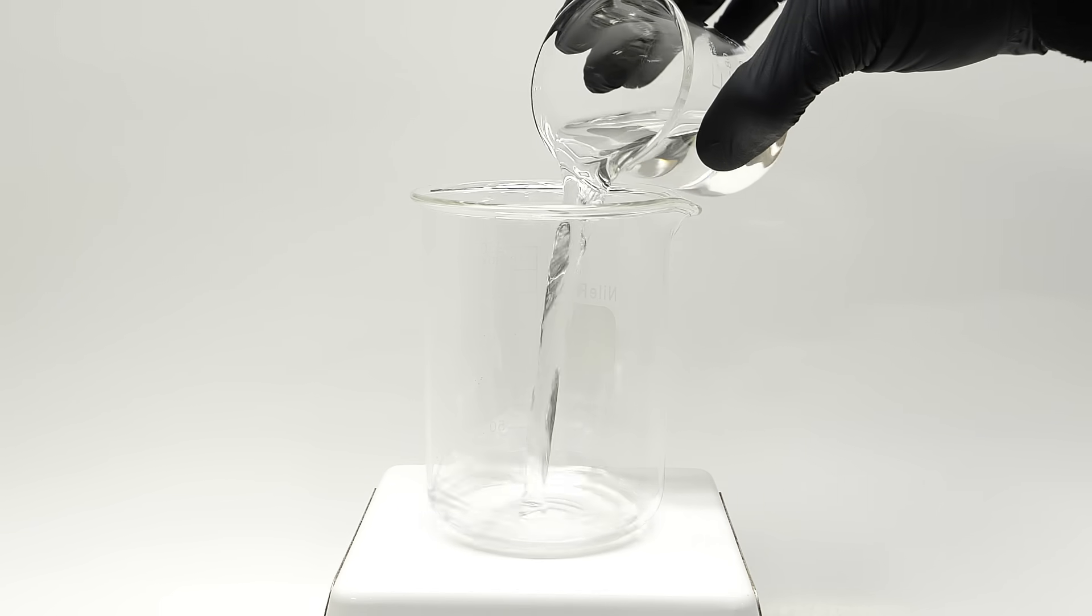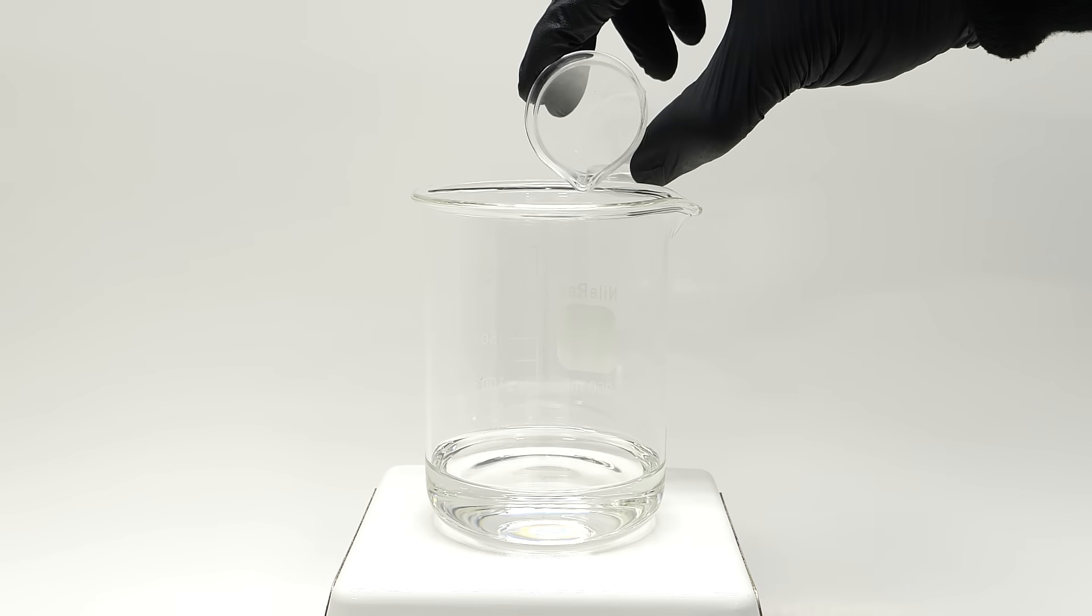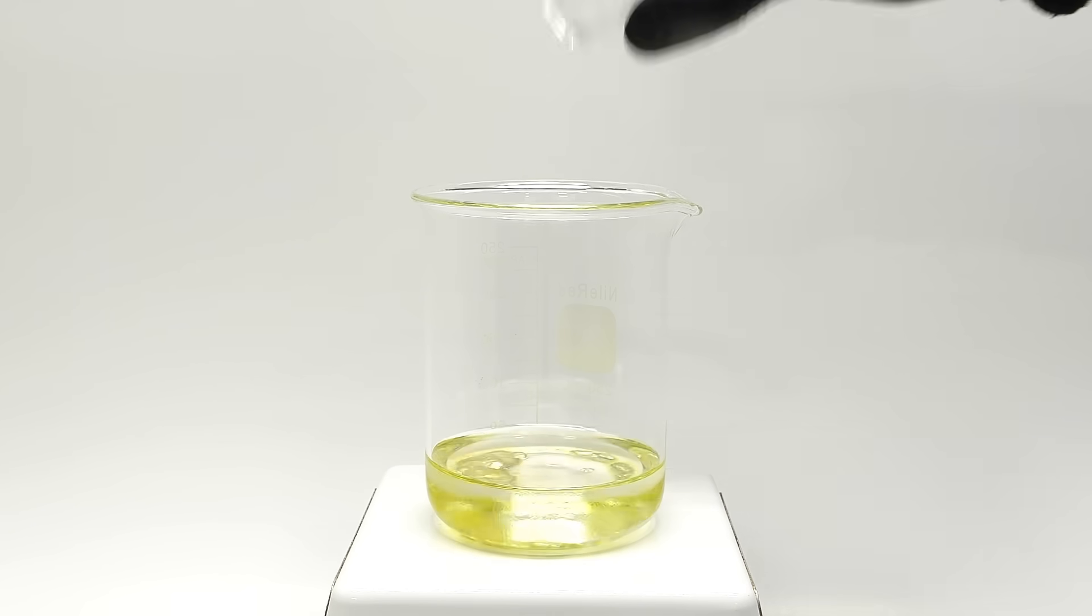To get started, the first thing I'll need is some concentrated nitric acid. Then into this I'll add a small amount of the mercury metal.